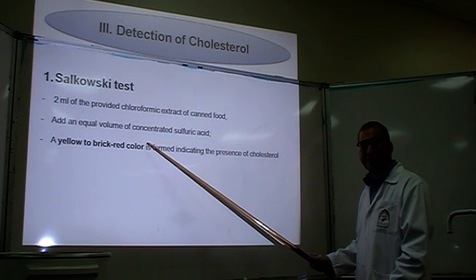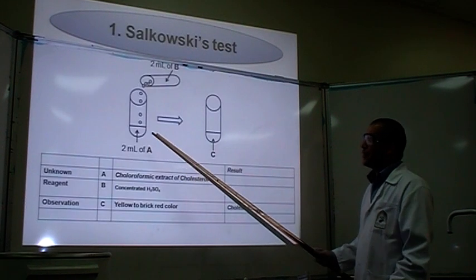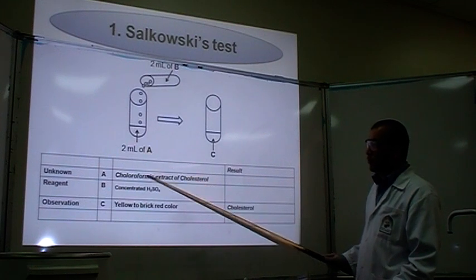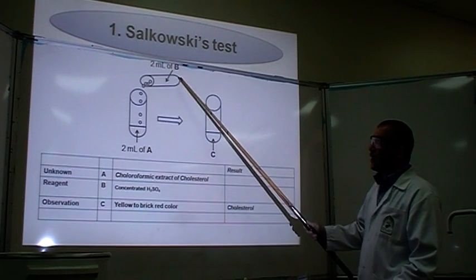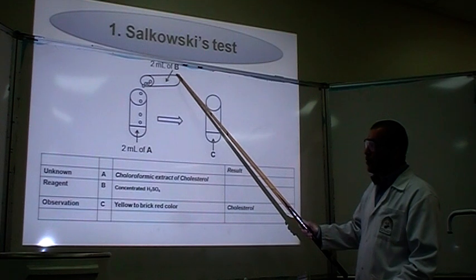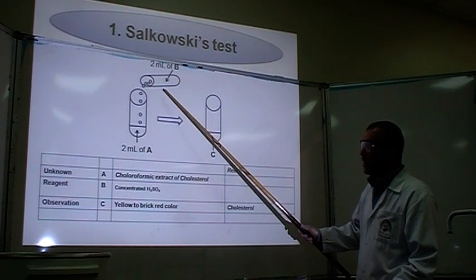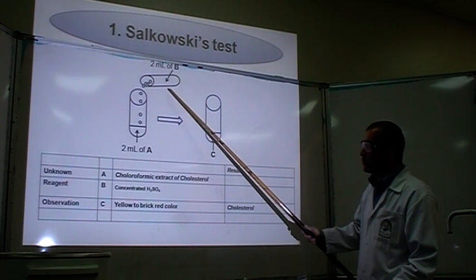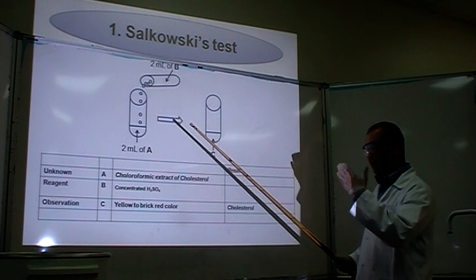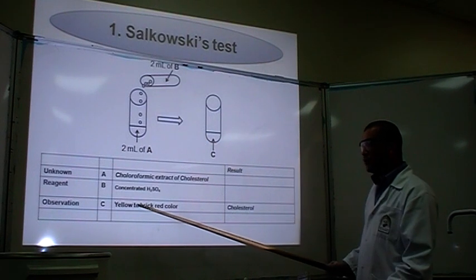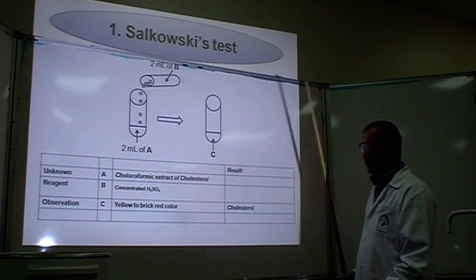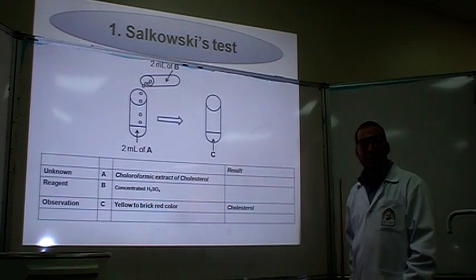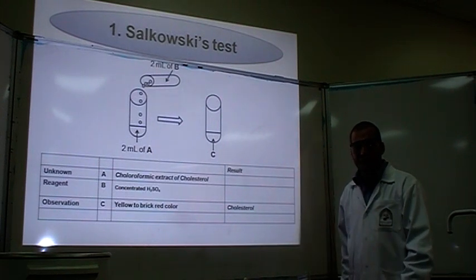To summarize: take two ml of chloroformic extract of cholesterol, then add two ml of concentrated sulfuric acid. You have to tilt the tubes, and you will get a yellow to brick-red color. So let's do the experiment — let's focus on the channel.